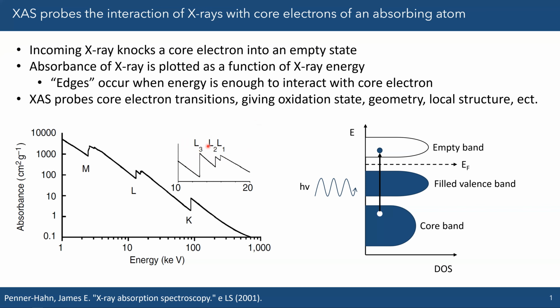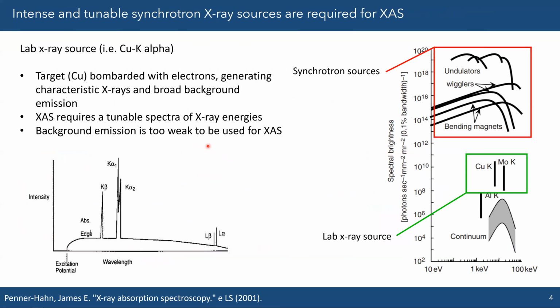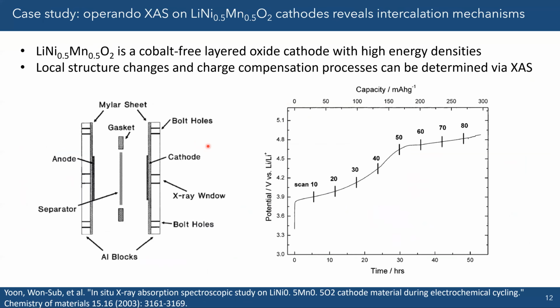Any other questions? Sorry, I do have a question about the in-situ measurement in general, for battery research. When you do the measurement, do you do a holding, or do you just continue to charge or discharge it?